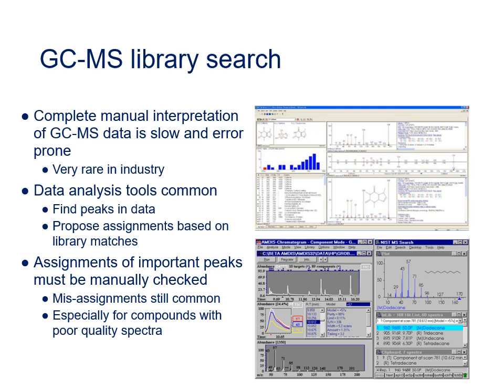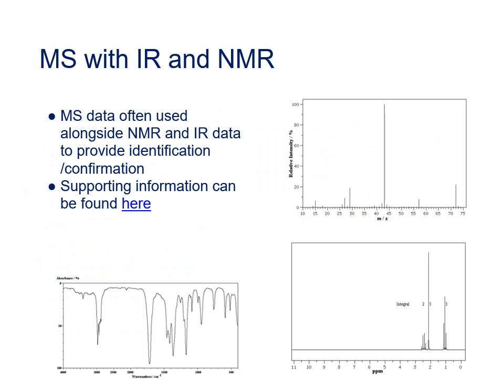During the development of small molecule pharmaceuticals, GCEI mass spectral data is often combined with both NMR and infrared data to identify or confirm the structure of molecules. Consequently, combining mass spec, infrared, and NMR data is still a very useful skill to have, and this link will take you to some useful online resources. On the next slide is a very good video that is available on YouTube.